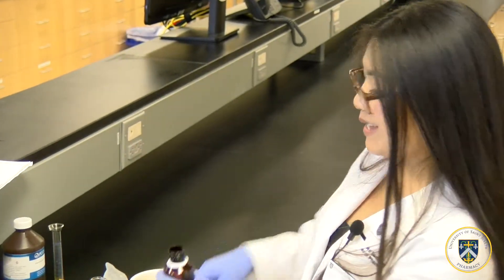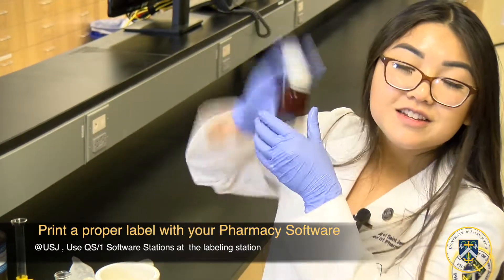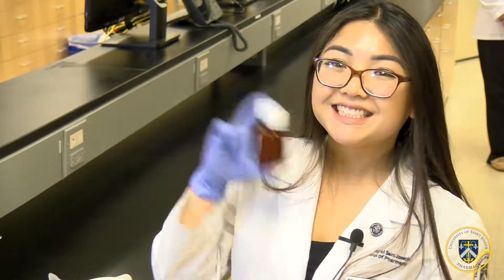Now that it's at the 60 milliliter mark, make sure you shake the castor oil emulsion, then you can label it and dispense it.